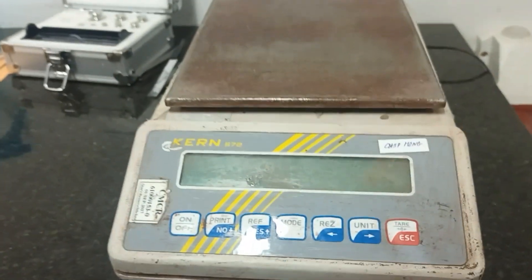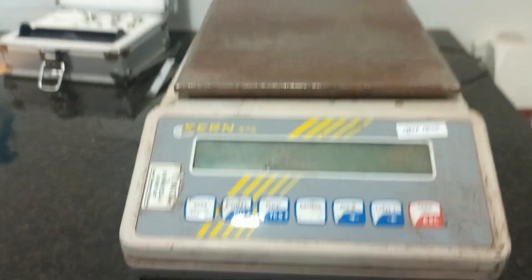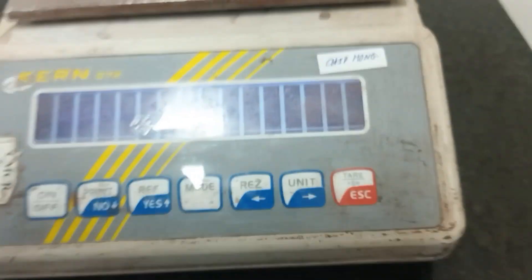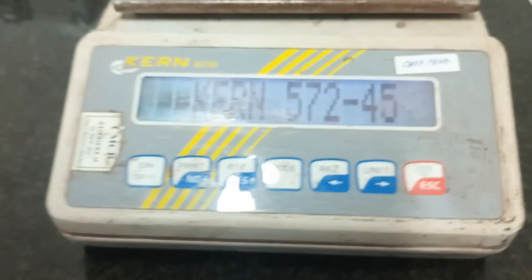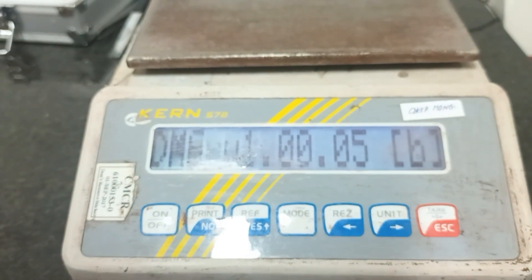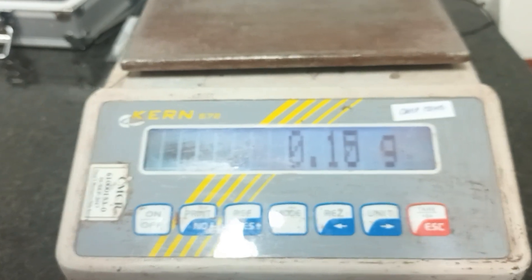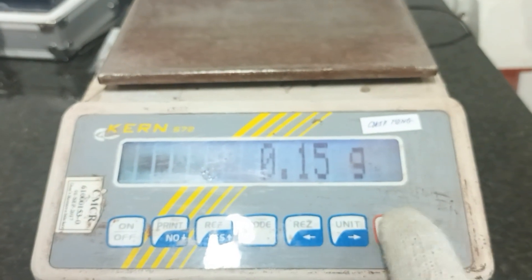Hello everybody. I will do calibration of electronic balance, model Ken 572. First, I will turn on the balance and wait for it to stabilize. Okay, now I will press here.